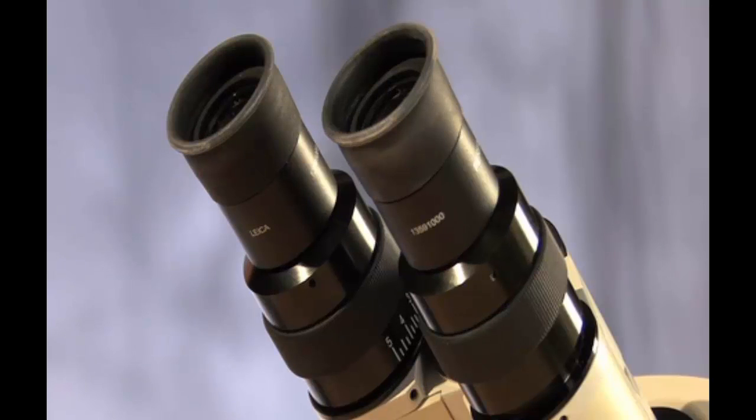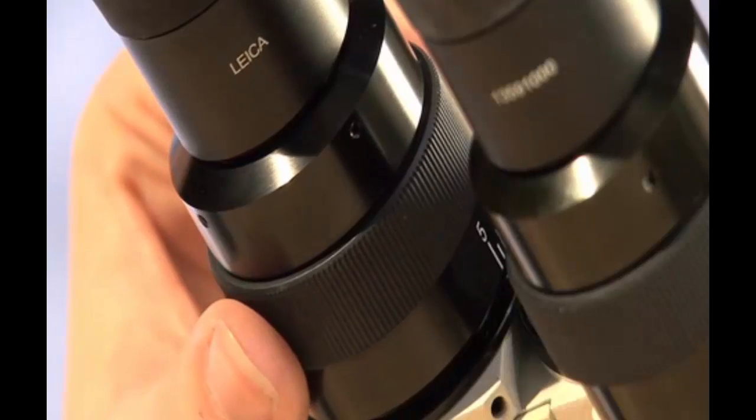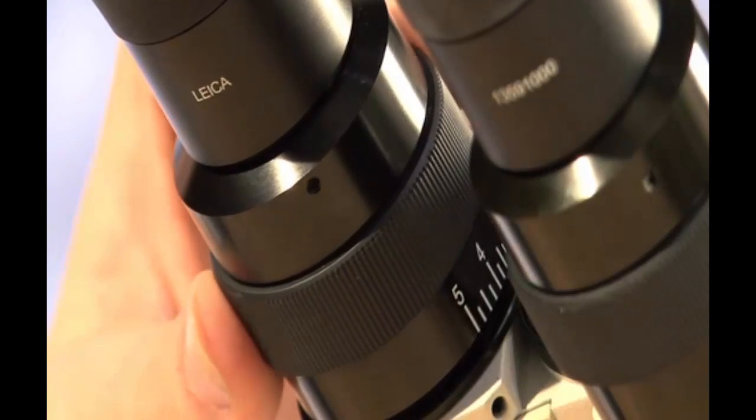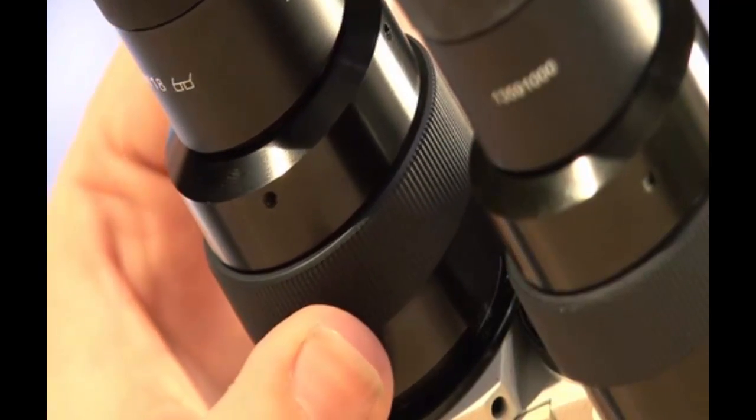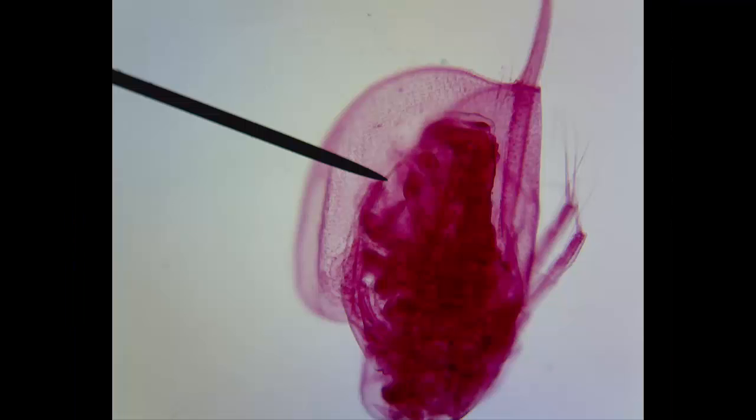Also, you will find in the left eye there is a diopter, or adjustment ring. This will allow for focusing your eyes when they're slightly different. Inside one of the ocular lenses, you will also see a pointer. This is a helpful tool when you are looking at a specimen under the microscope.